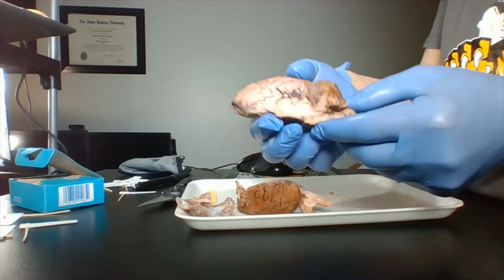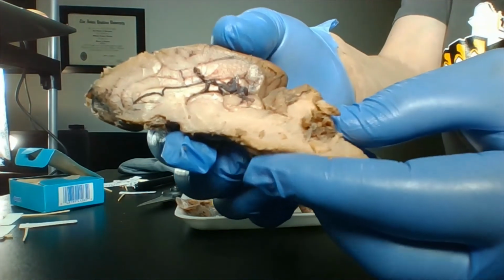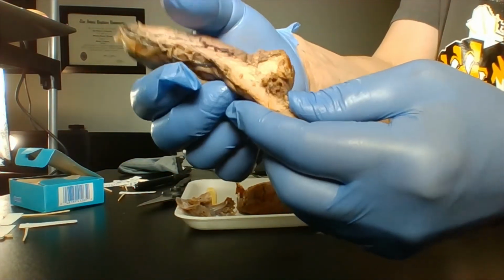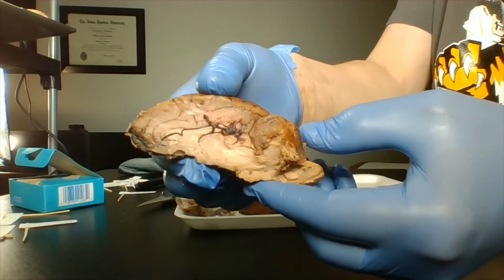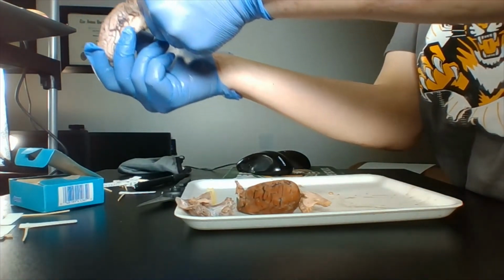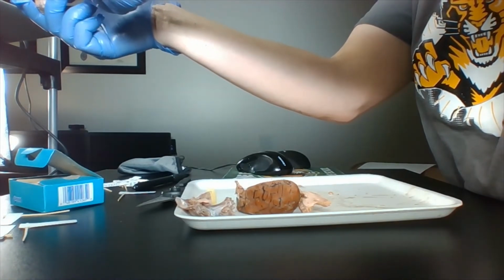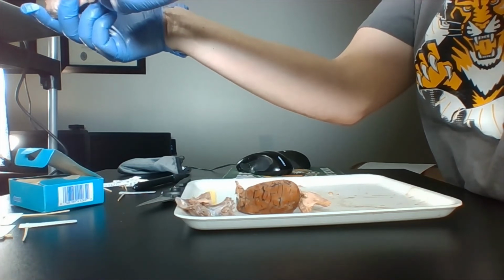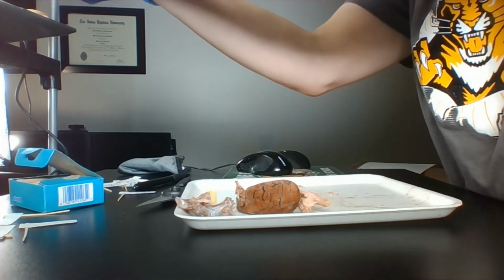All right, so let me put that closer to the camera so you can see the cross section. Put it back together there. Remember, this is the cerebellum, and the cerebrum is the bigger part. It's divided, so that's why it was coming apart. Here's the top view. The cerebrum is in the front. The cerebellum is in the back, and then there's the cross section.